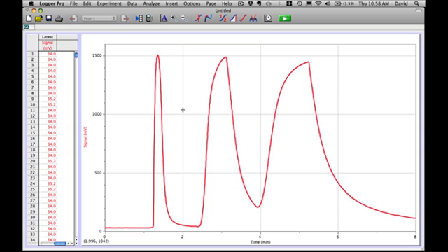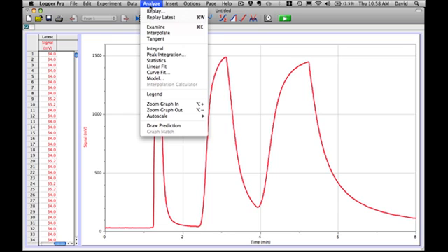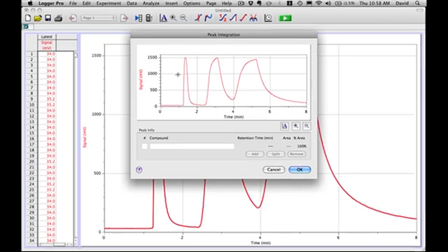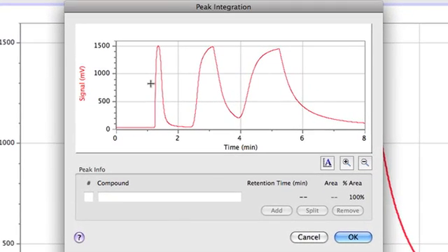Now for analysis, there is a feature in Logger Pro software that's new under the analyze menu that's called peak integration. When I select peak integration, I get a small dialog box with an active graph and I can select each one of these peaks, one at a time to analyze.